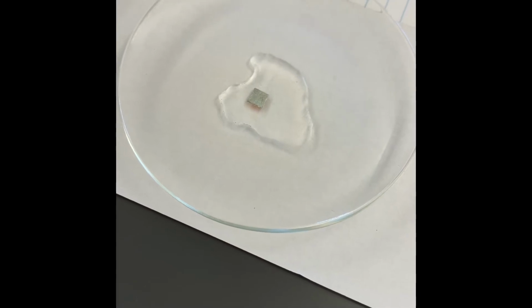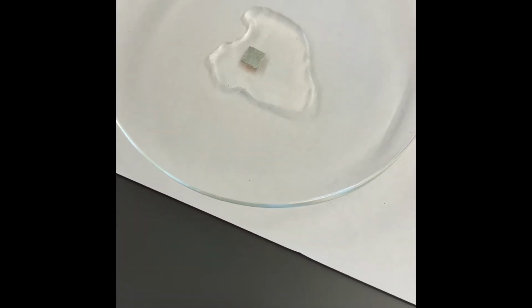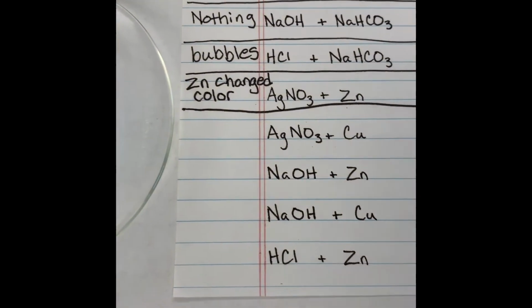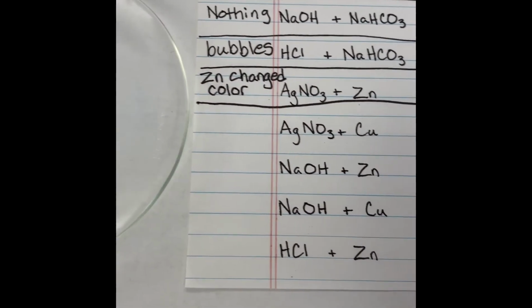It no longer looks like copper, it looks like silver. And let's write for our observations that the copper changed color.